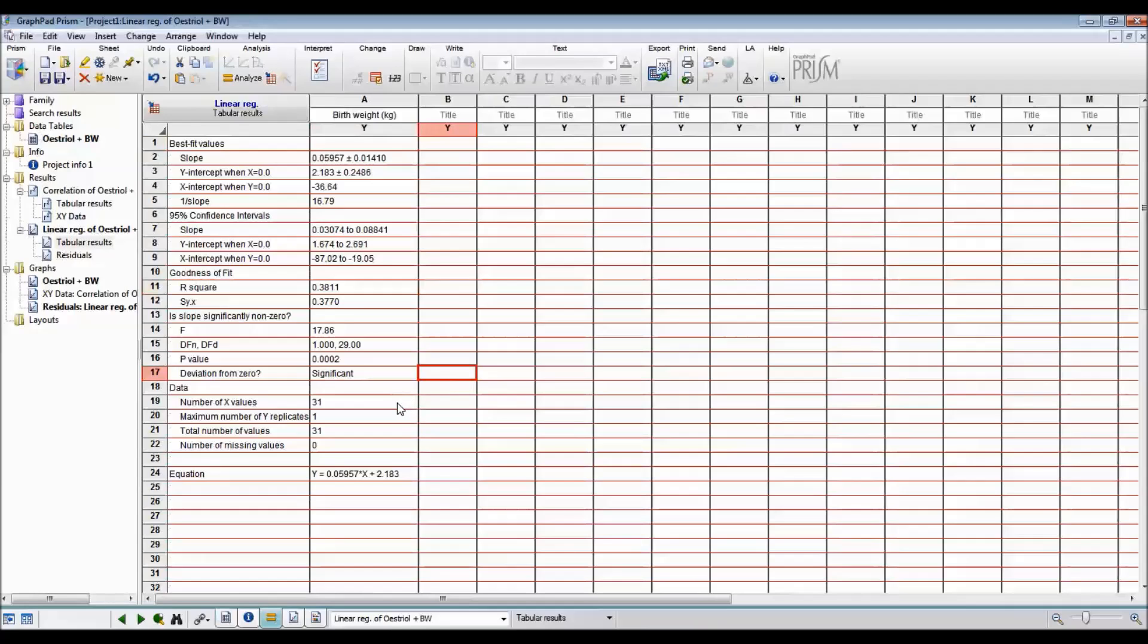There are 31 observations. And the line of best fit is Y equals 0.05957 times X plus 2.183.